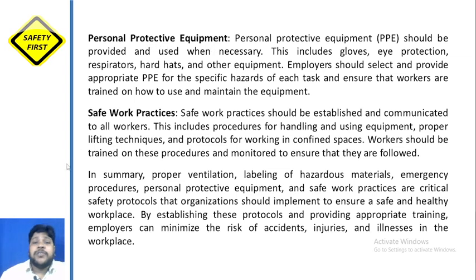Personal protective equipment should be provided and used whenever it is necessary. This includes gloves, eye protection, respirators, hard hats, and other equipment. Employers should select and provide appropriate PPE for the specific hazard of each task and ensure that workers are trained how to use and maintain it.